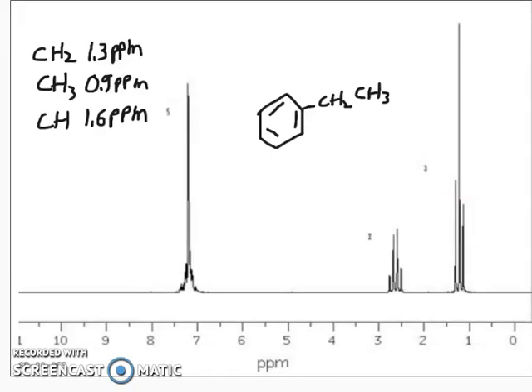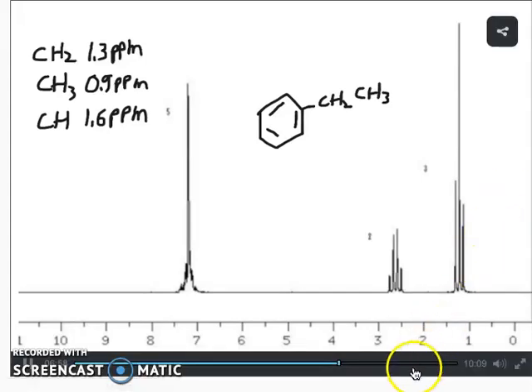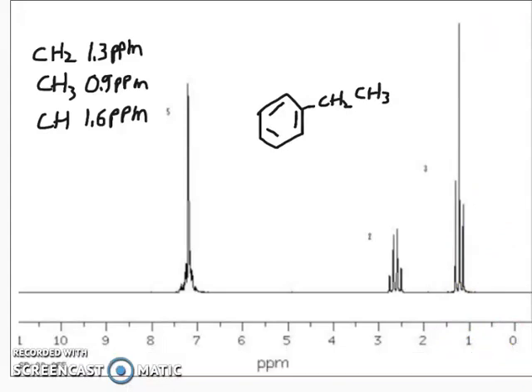There are a few other functional groups I want to discuss, because these are chemical shifts that you definitely should recognize. In particular, I want to point out that anytime we have a peak between about 6.8 and 8.0 or so, that's a really good indication that we have an aromatic ring in our molecule. So in this NMR spectrum, the peaks from our benzene ring, our aromatic ring, are showing up at just over 7.